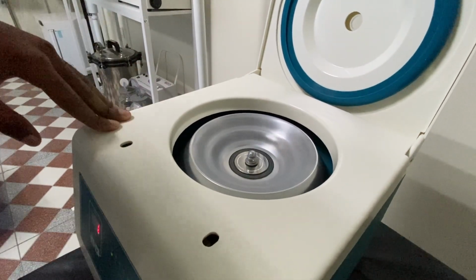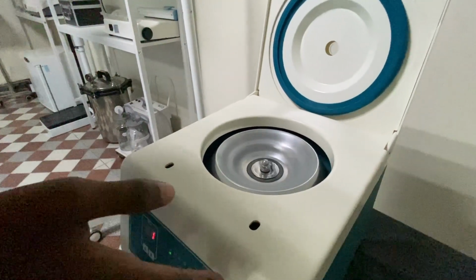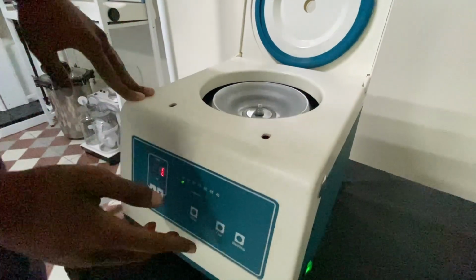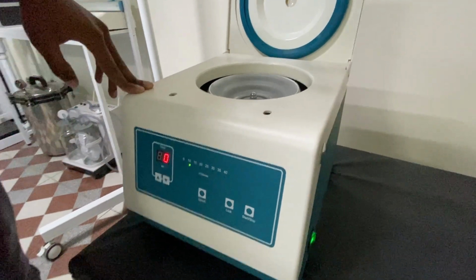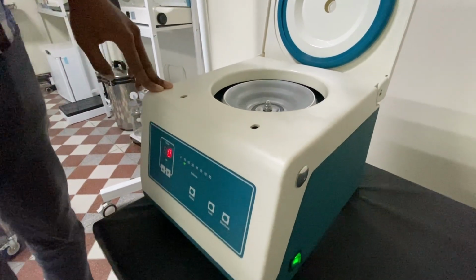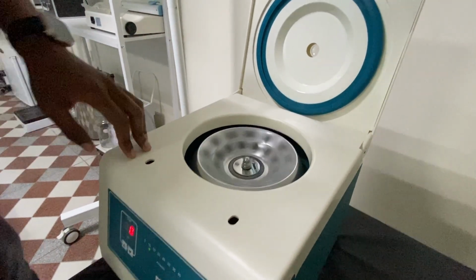Slow, very low, and if you want to stop it, you can just click the stop function here. But all that's depending on the mixture you have. So this is our low speed centrifuge.